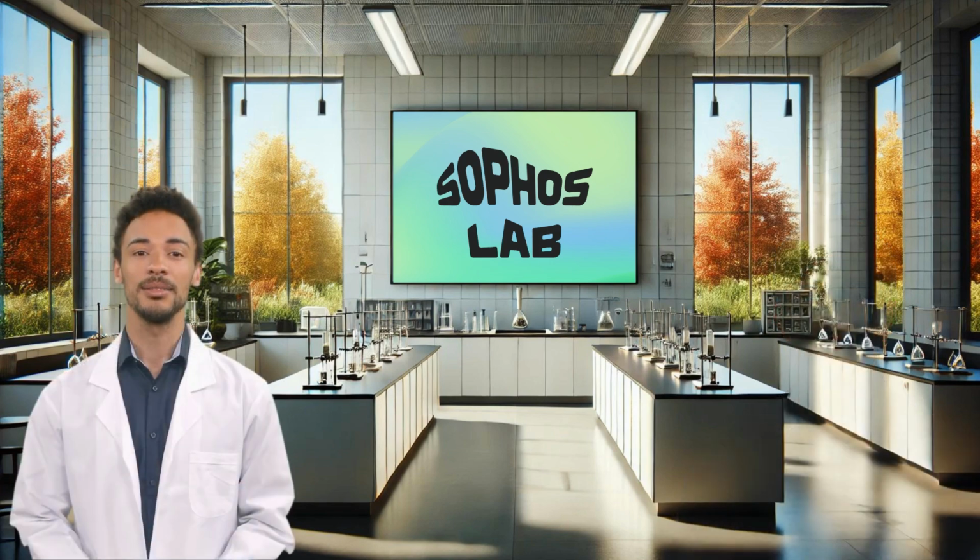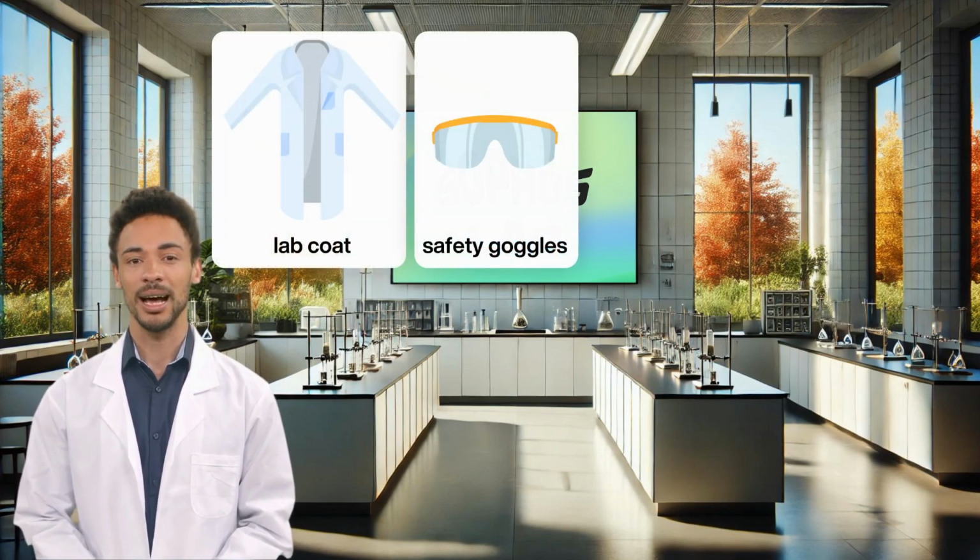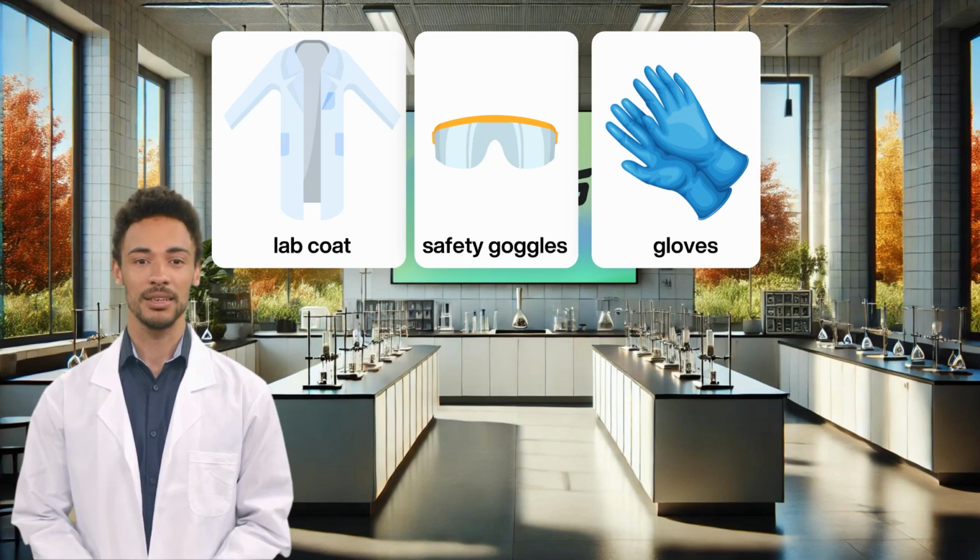Hi everyone, I'm Sam. Before we get started, make sure to put on your lab coat, safety goggles and gloves. Remember, safety is our top priority in any lab environment.